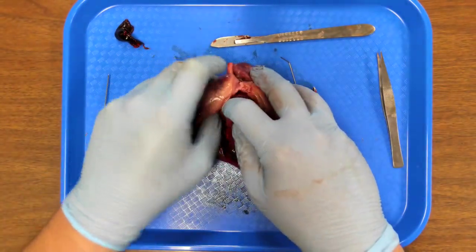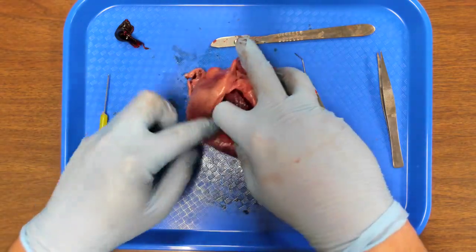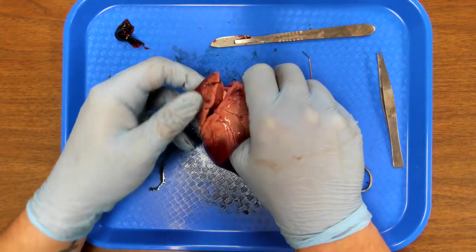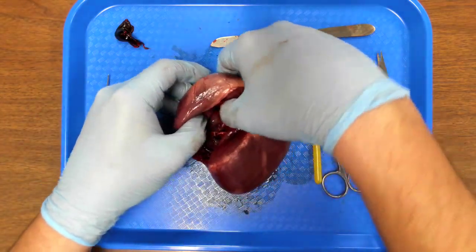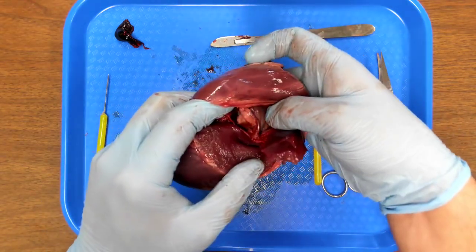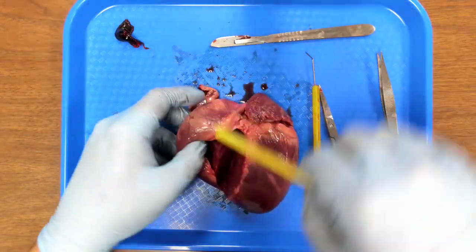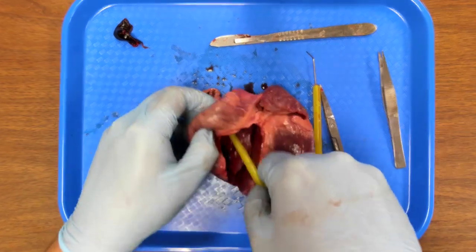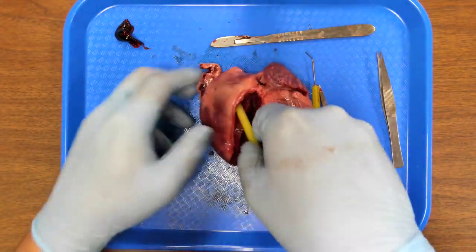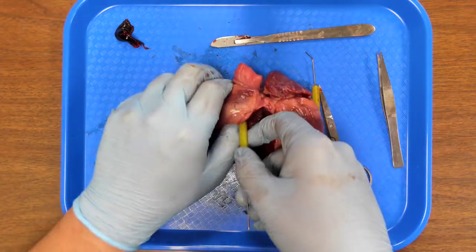And so if we look, they're connected to, I can find one here. It's a lot smaller than the deer heart that I just did. First of all, I want to show you, if I take my probe, I can come out the top here.